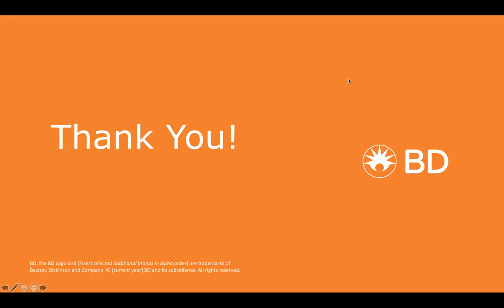Question about t-SNE. What does it mean when dots are close together in t-SNE? Well, if they're part of the same exact island, I'll say that they are probably the same cell type, or at least fit into a broad category that's similar to their closer nearest neighbors. But if they're in totally separate islands that are distinct in Euclidean space, that doesn't necessarily mean that those two islands are not closely related to one another. Sometimes similar islands are just pushed apart because of the differences that occur there, but maybe they're actually more similar than islands that occur between the two.